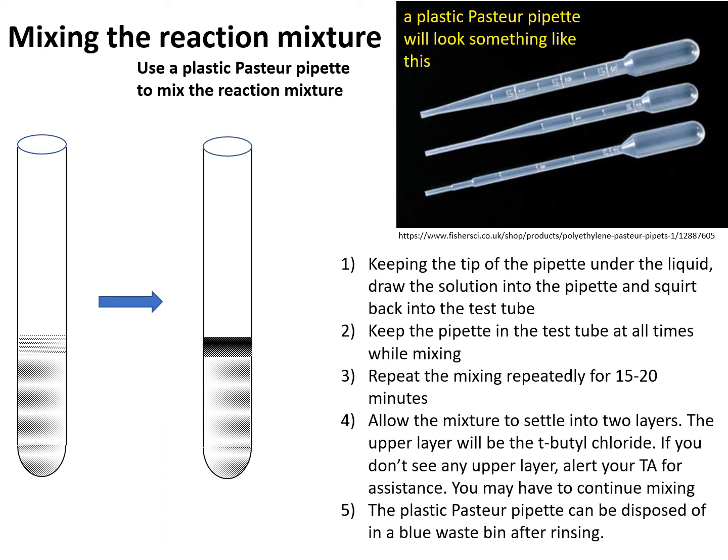We will be doing this several times during the experiment, and please remember not to reuse the plastic Pasteur pipette in the further experiments.